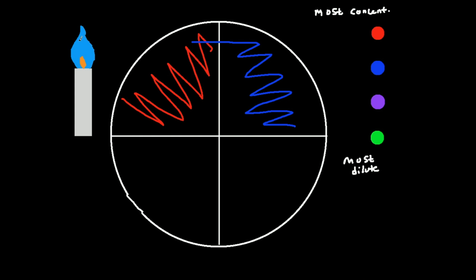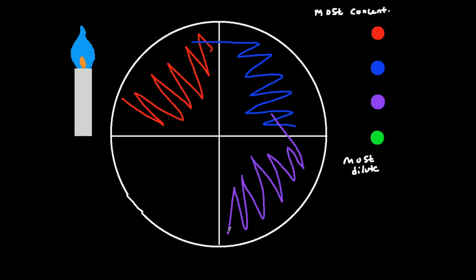Then I put the loop back in the flame, sterilize it, wait 10 seconds to make sure it's cool enough, and do the same thing: drag my loop through a small part of the previous quadrant and then zigzag in the third quadrant. Then I stick my loop back in the flame, sterilize it, take it out, wait 10 seconds, drag the loop through one small part of the previous quadrant, and then zigzag into the fourth quadrant — and then you're done.